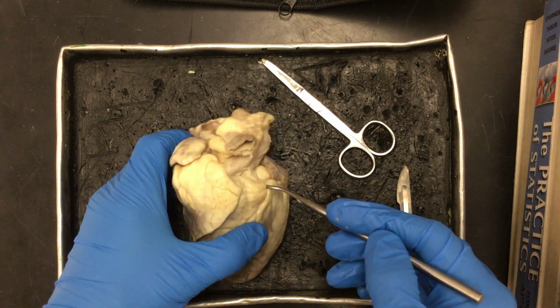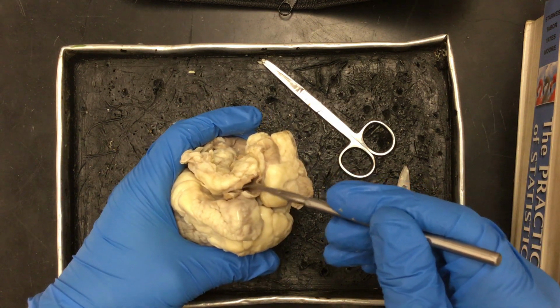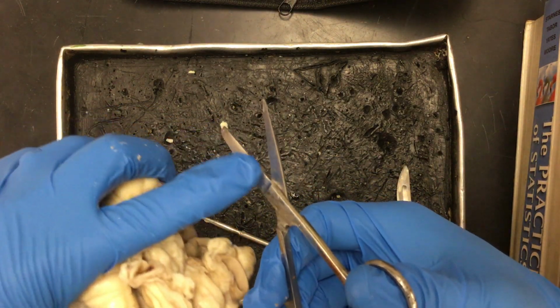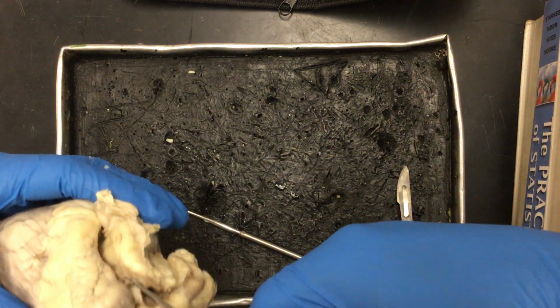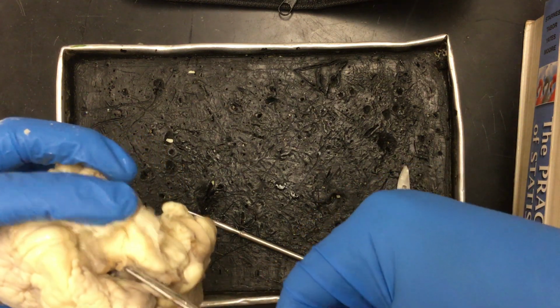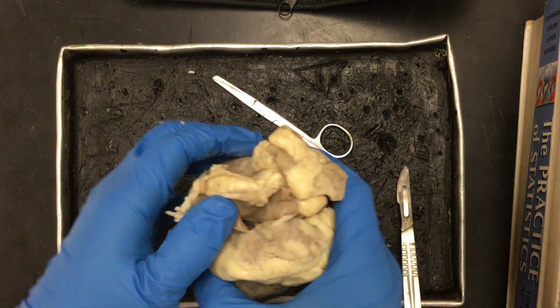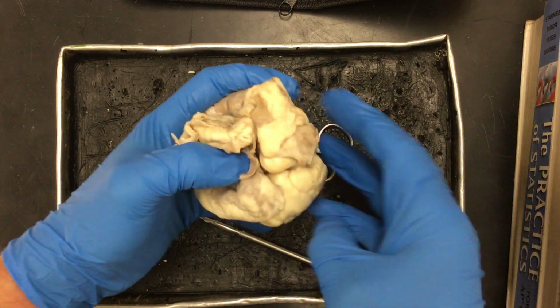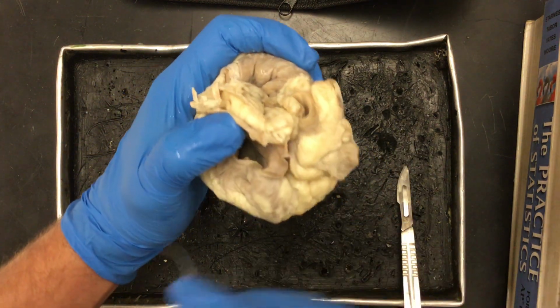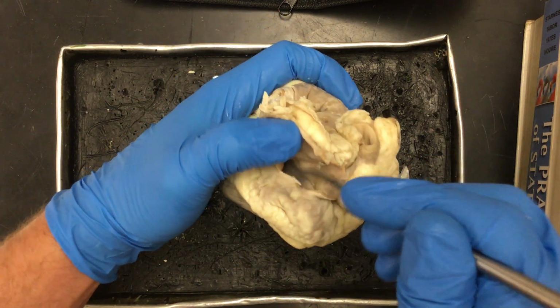All right, so now we look at the superior vena cava up top here. I'm just going to cut down at 3 centimeters. This happens to be 3 centimeters, so that's an easy cut. I just put it in there and I cut the entire length of those scissors. And I can open it up from this direction. I can better reveal this right atrium. So this is the right atrium.